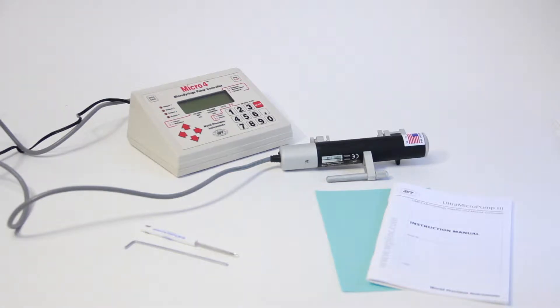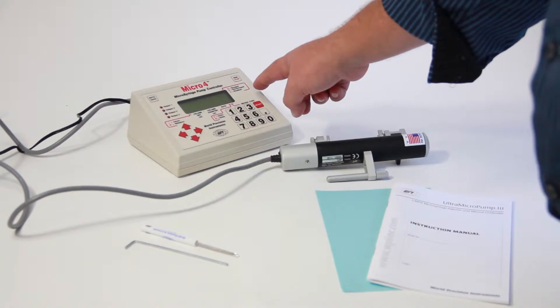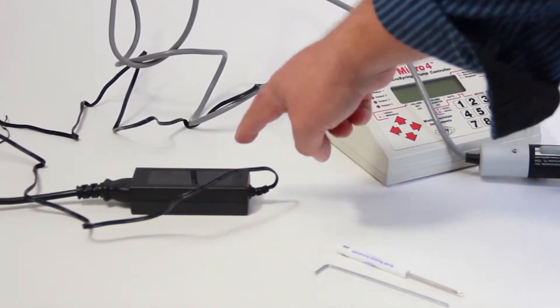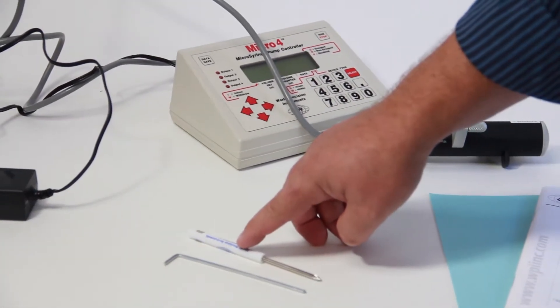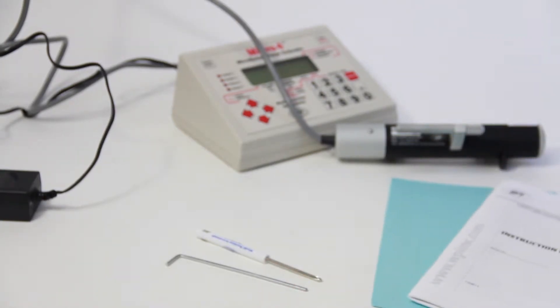First, let's take a moment to run down all the components of the complete system. When you unpack your UMP3 you should have the following: the UMP3 ultra micro pump, the Micro Four four-channel controller, one 12-volt power supply, one power cable, one Phillips screwdriver, an allen key, and finally an instruction manual.